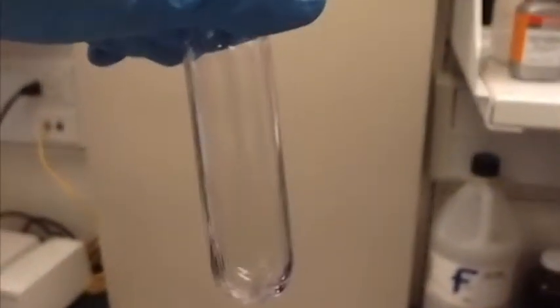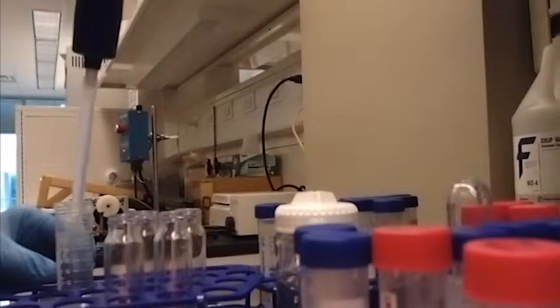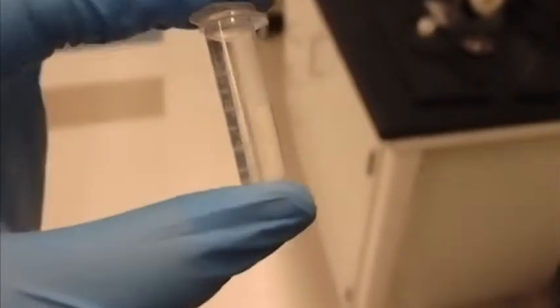The next day, it is centrifuged to separate the solid PIA from the ethanol. It is difficult to see on video, but there is some clear PIA on the inside surface of this tube. A small amount of water is added to the tube to re-dissolve the PIA. Here you can see some insoluble impurities, which will later be removed.